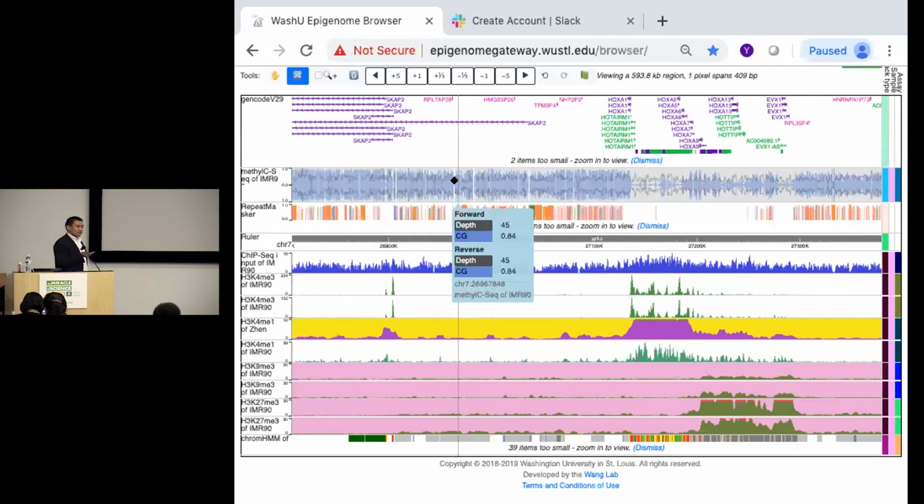Related to this, if you have a CpG methylation level of 50% based on 100 reads, you're very confident about 50%, because 50 reads say methylated, 50 say unmethylated. Perfect. But you can also get a 50% call based on 2 reads. One read says methylated, the other says unmethylated. So it's also 50%, but you're probably not very confident about that level. That information is also lost in the typical way of looking at whole genome bisulfite data. Both are 50%. You can't tell them apart.